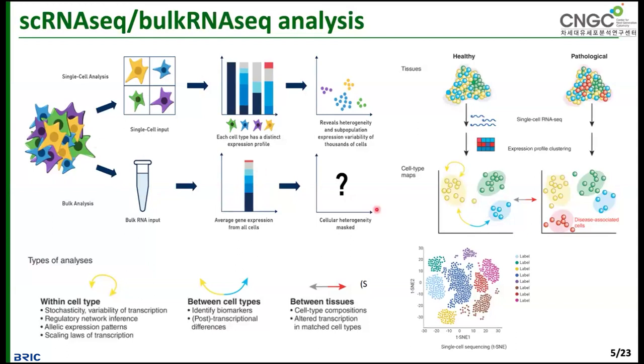So this will be misleading for our data, and it is very difficult to conclude how B cell responds, how T cell responds and how NK cell responds. It's very difficult to analyze when we are using traditional bulk RNA analysis. For this kind of problem, we need to think of an alternative, and we could perform these cells one by one. For example, if I separate only the yellow color, or NK cell or B cell separately, it takes a long time. The experiment is also not in real time, not at the same time. It is costly and time consuming. There are so many problems, so we need to overcome this.